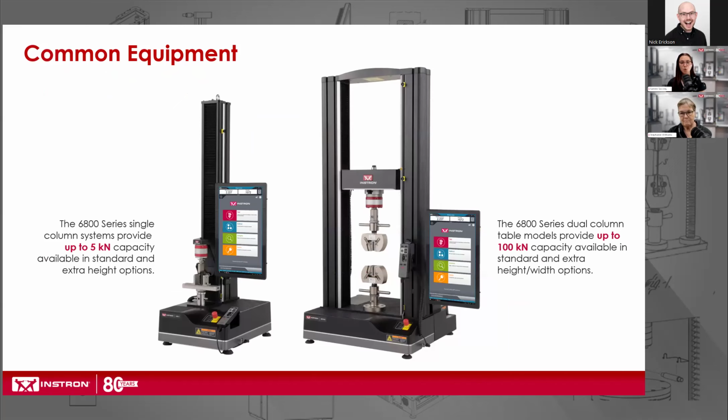So what type of equipment should you be using for static testing? As identified on the product data sheet, the biggest need for testing on a static system is going to be tension testing. A couple other test types would be compression and flexural tests. Typically, in tension, plastics don't exceed 5 kilonewtons of force, but reinforced plastics can see 10 kilonewtons or more in tension.